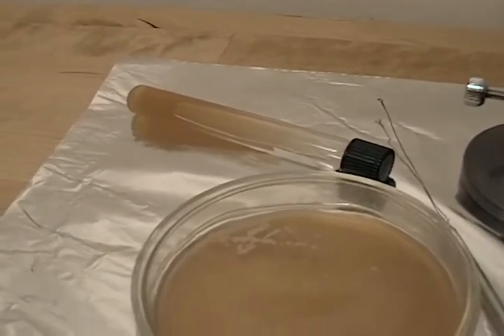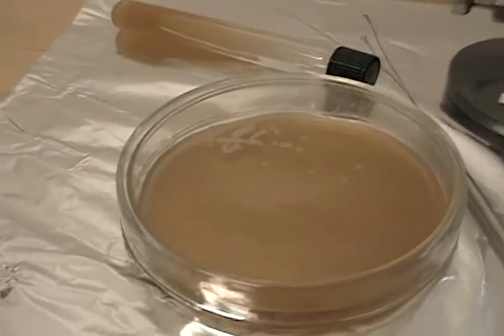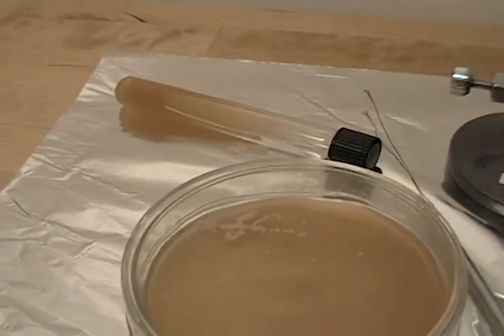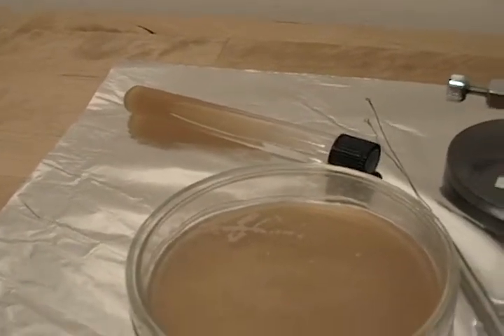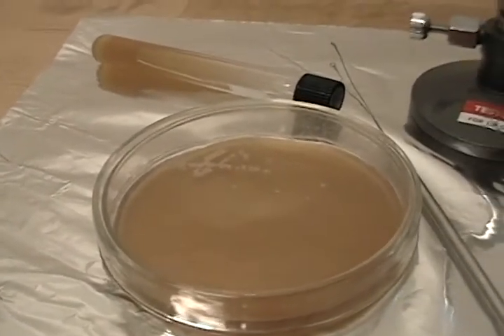The medium for the slant tube was prepared the exact same way that we did for the plate, except we just put it in this tube and laid it on its side to solidify so that we would have a large surface area to spread our yeast on. So we'll get started.